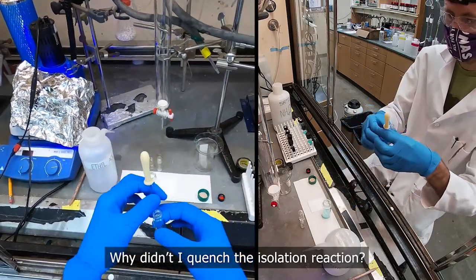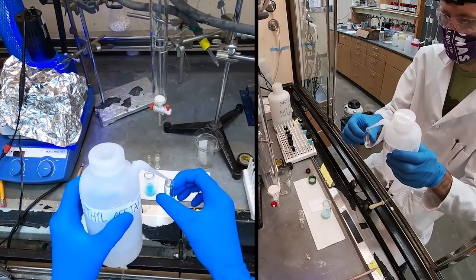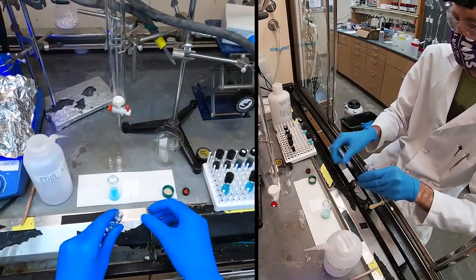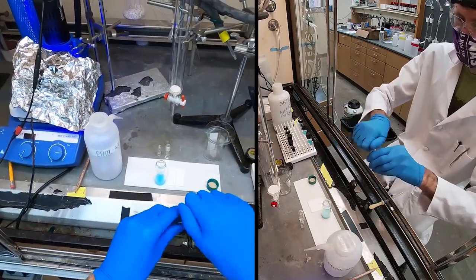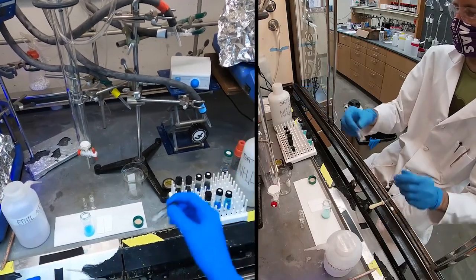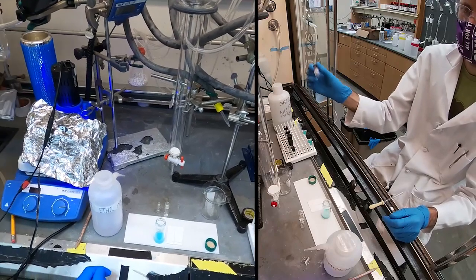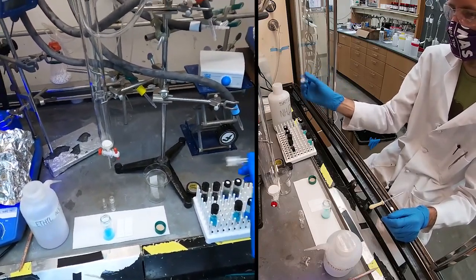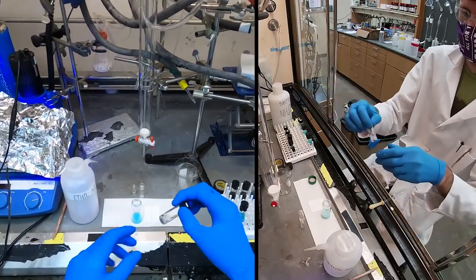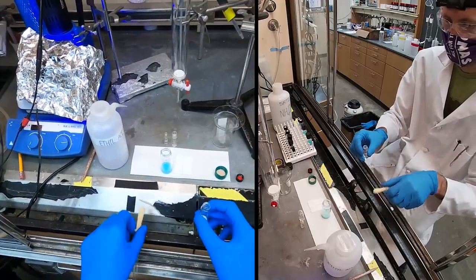I only do that quench for the reaction that I want to analyze by TLC or NMR or gas chromatography. But if I'm going for an isolation, there's no need to quench it, and it makes everything a lot quicker, because now I don't have to do an aqueous workup with a sep funnel and get out my drying agents and filter and rotovap. All I need to do is transfer one of these reactions and its entire contents into the vial.